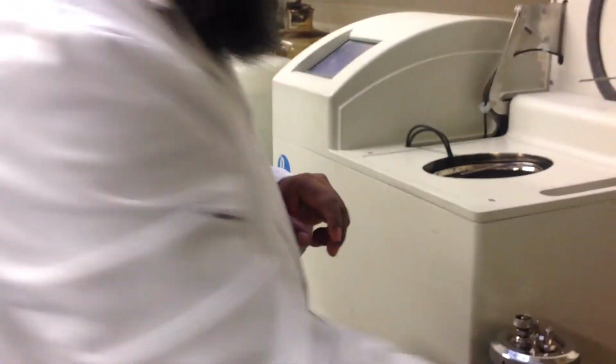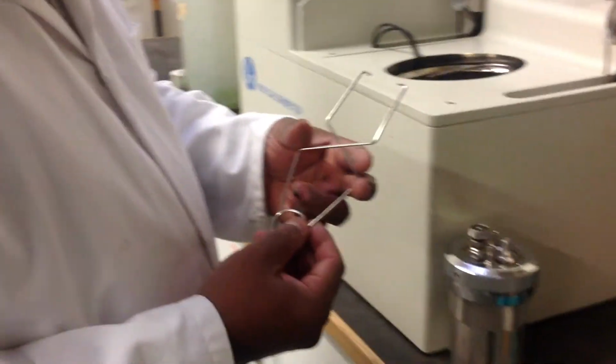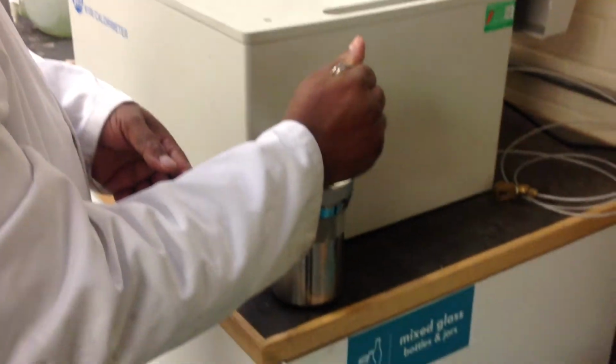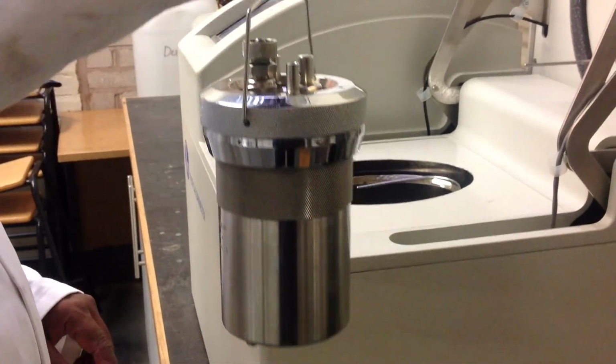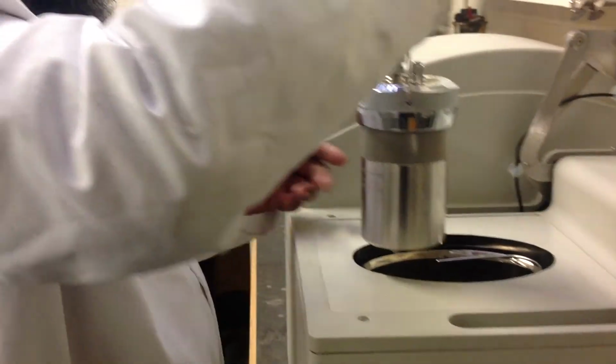Then using this fork, the lifting handle, we can lift this whole vessel and put it into the bucket inside.